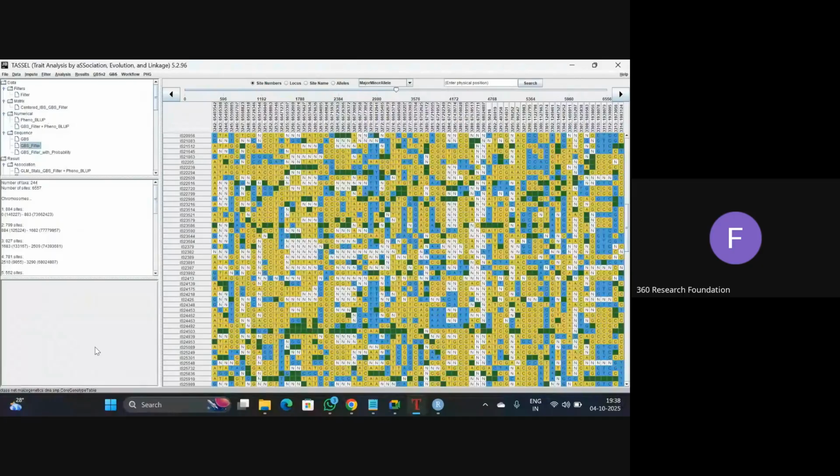Just now I will show that RMVP model with this normal file. No problem. Result will be same. You can convert, no problem. A numerical file we strictly need for ICIM mapping, QTL mapping. Okay, sir. There we need a compulsory numerical file. But here we can run.